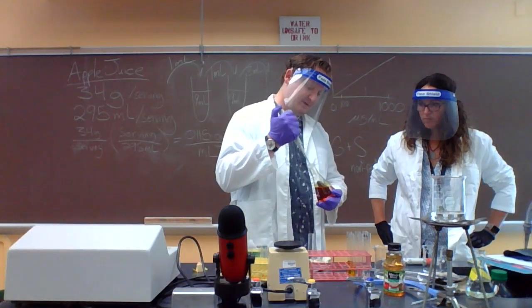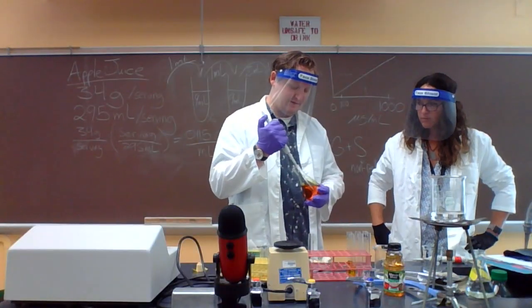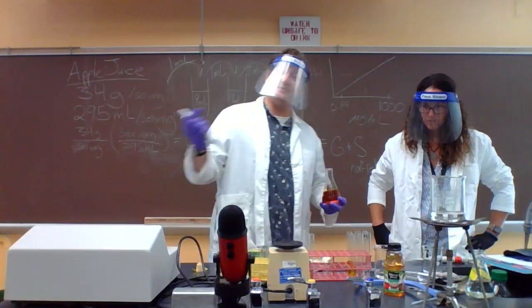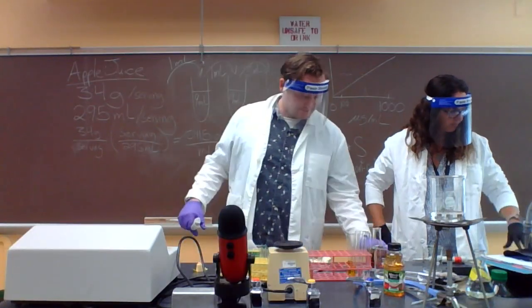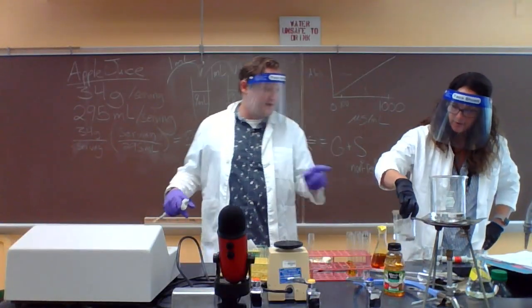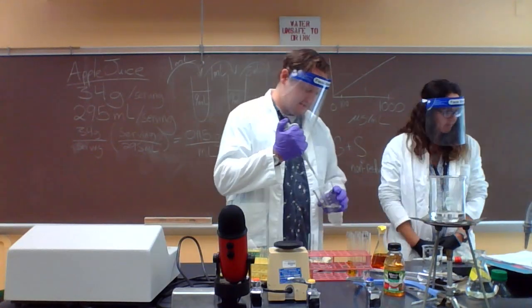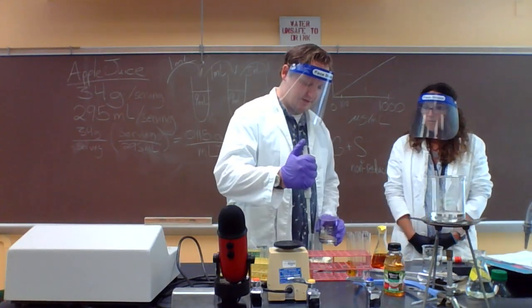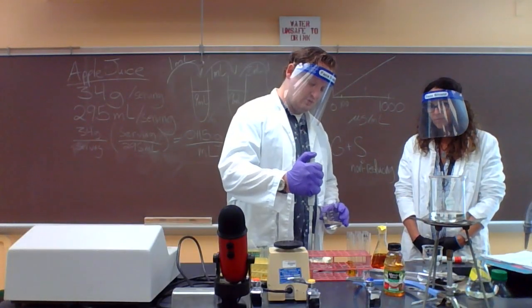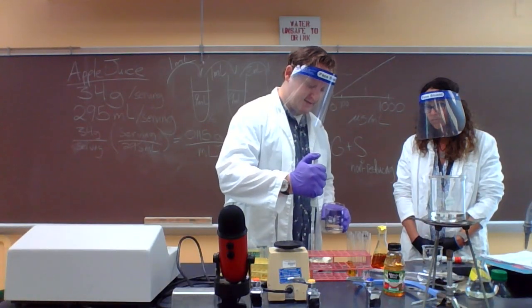1, 2, and then 3. 3 mils of DNS. Now we need 3 mils of water. That's the pure water right there, right? Yeah. I'll just use the same tip. And 1, 2. And if I remember my training, that makes 3.